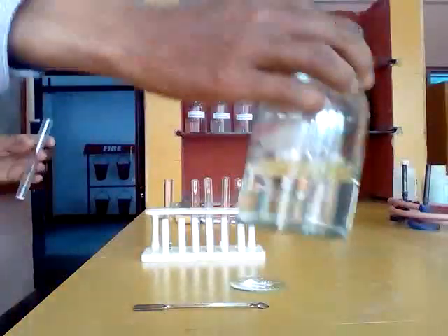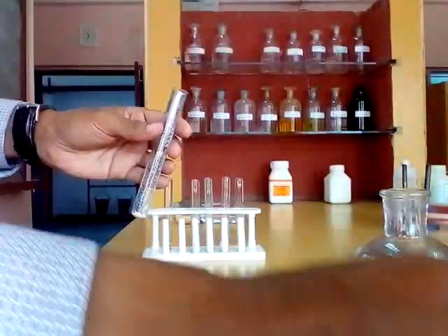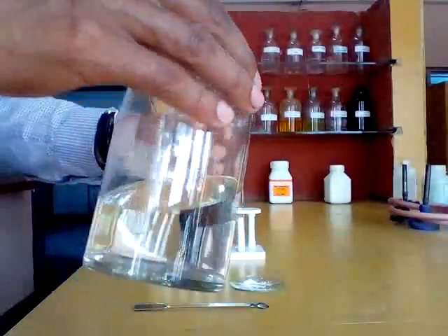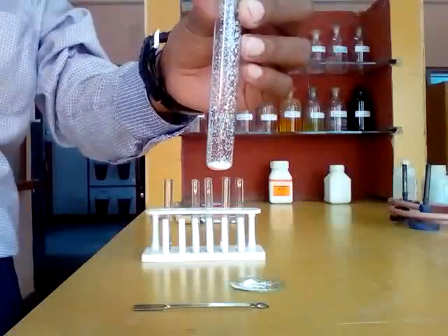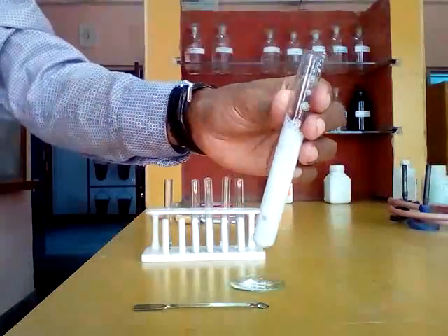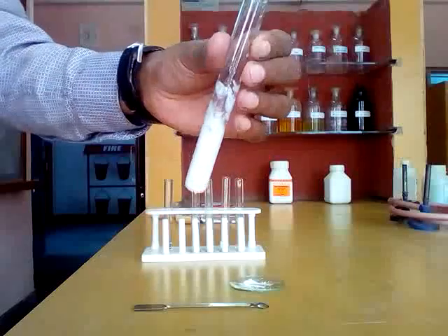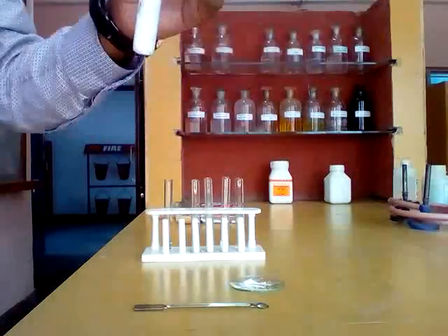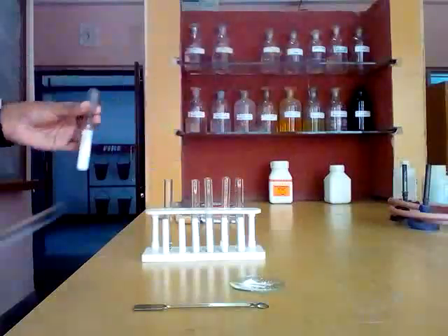Then you put here concentrated sulfuric acid, a very small amount. Use less amount of reagent. Here you see very light white fumes coming, and it is very pungent. It smells very pungent. So it is the observation for chloride.